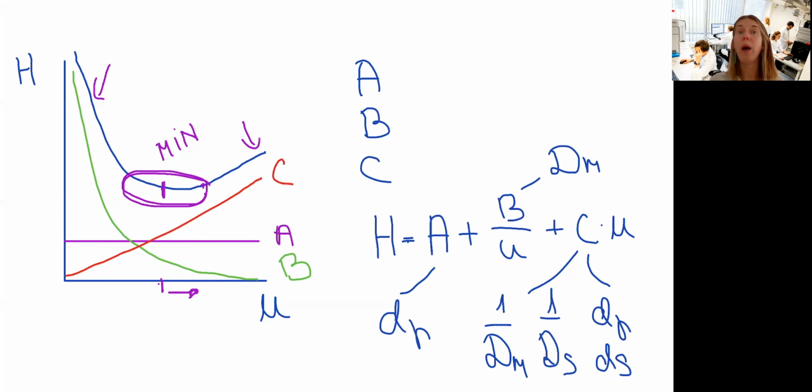Shortly, this was about the way peaks become broad in chromatography, and we viewed this on the example of a particle-filled column. It is fairly similar for capillary columns, and we will have a look at this further for the capillary columns once we talk about them in gas chromatography as well. So these videos were the introduction to chromatography, and we'll continue with gas and liquid chromatography in the upcoming lecture.